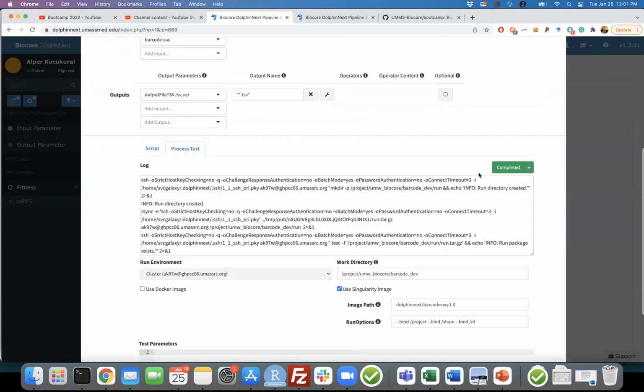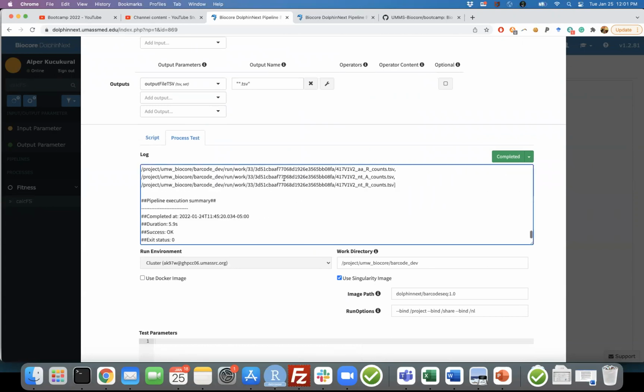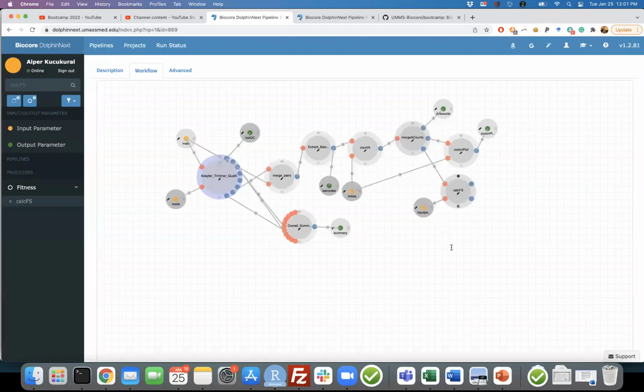These were my inputs and I did everything here. My resulting A files and R files are prepared here. Now I'm writing a new one to divide those R values and then get log2. I did that, by the way. But I started creating the calculation of the other two equations, F and S, and I started doing it here.